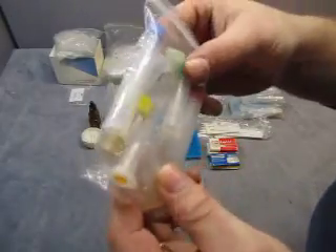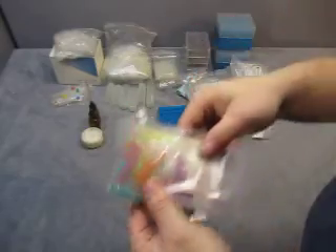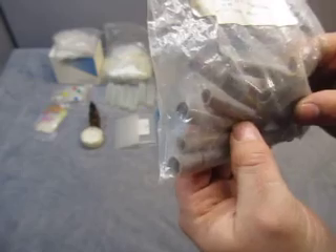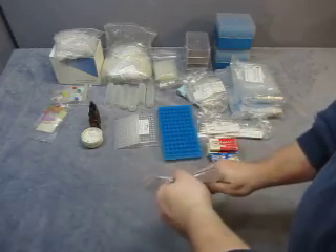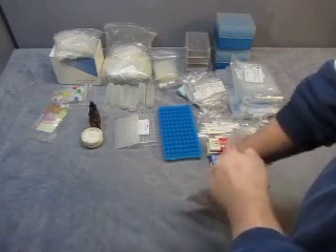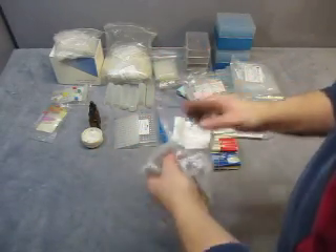Then you get some tubes that have lids — 1.5 mL tips, tubes with caps and stuff. Then you get some metal items here — there are 8 pieces, and they are Teflon Silicone Target Septa, 10 millimeter. That's what it says; we'll take one out and see what it is.